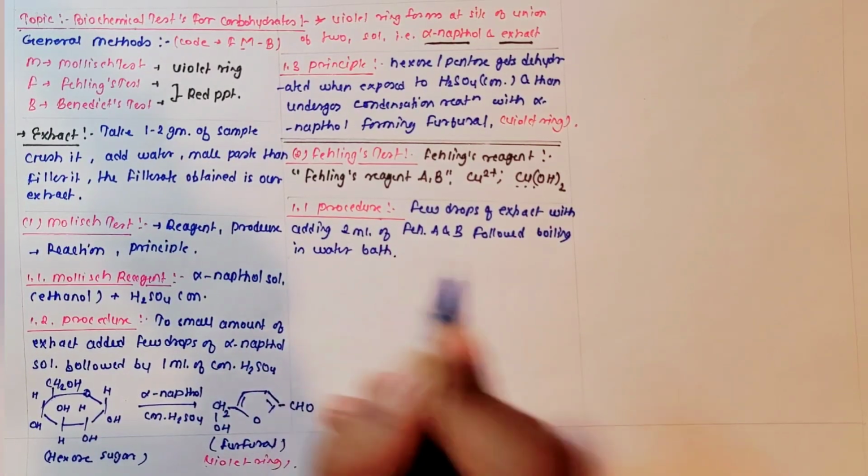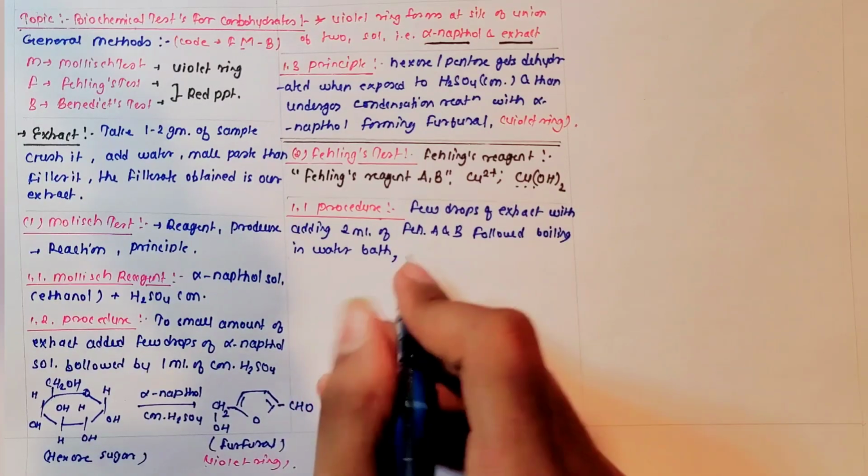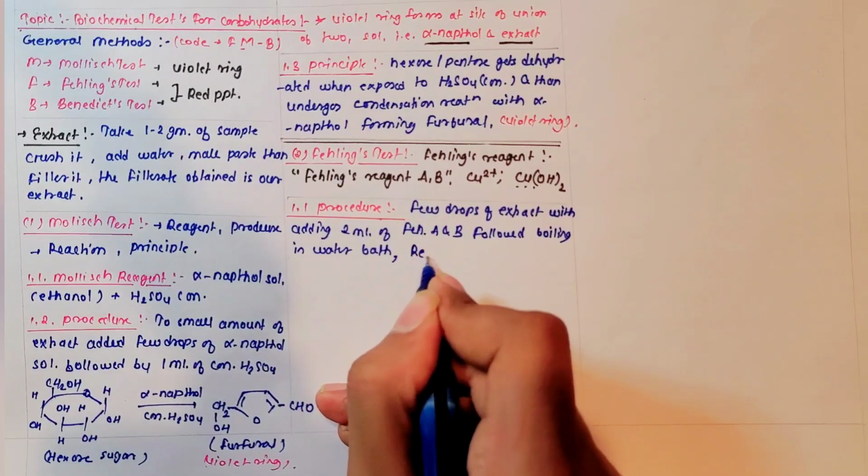So don't boil the test tube directly. We should be using the water bath. So what it will give, the end result will be formation of red PPT.